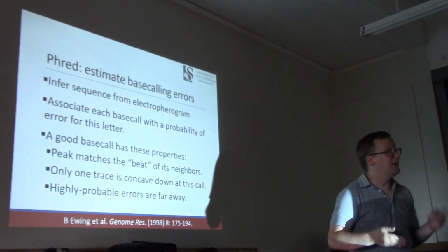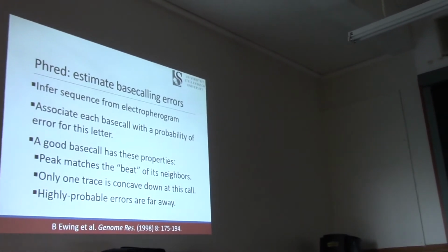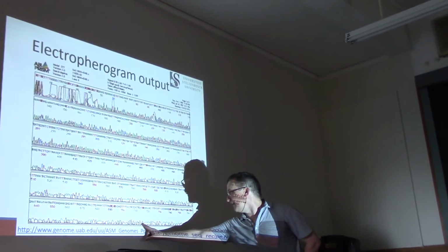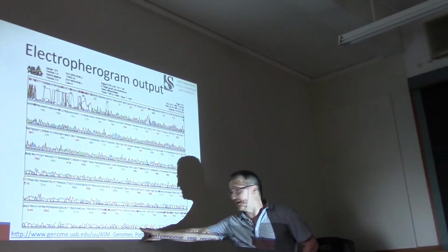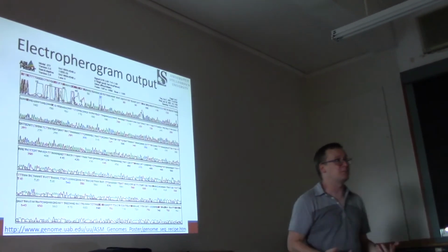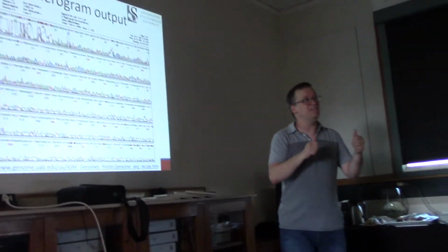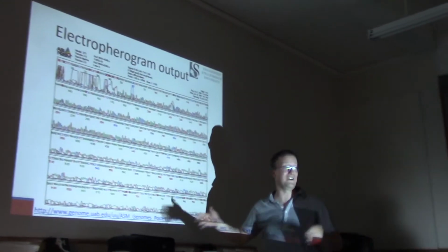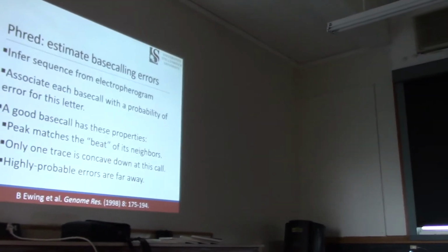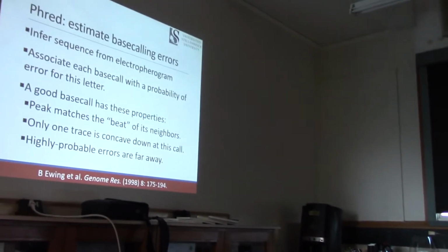It's not. In the same way, if you're in an electropherogram and you happen to be very close to a bunch of stuff that's unresolved, that's got lousy quality, your base calling error probability is high, even if this peak looks like a very pretty peak. Proximity to something bad can tar you with the same brush, to use the phrase.